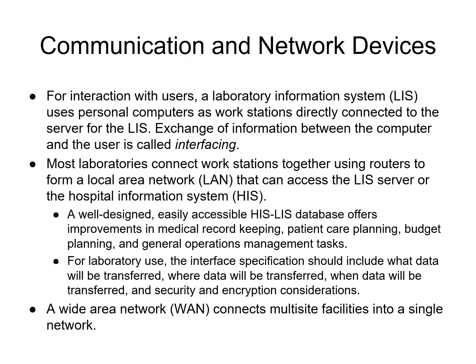A well-designed hospital information system and LIS database improves record keeping, patient care, budgeting, and operations. Interface specs should define data transfer details, timing, destination, and security or encryption. And then we also have a wide area network, or WAN, which connects multiple sites into one network.